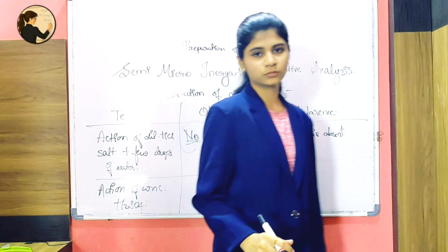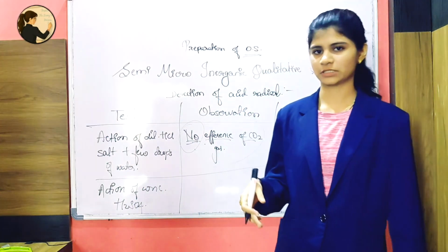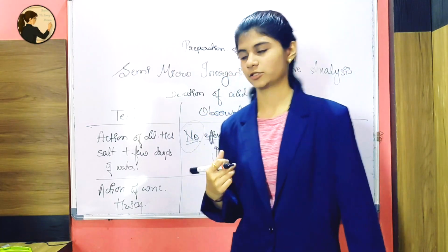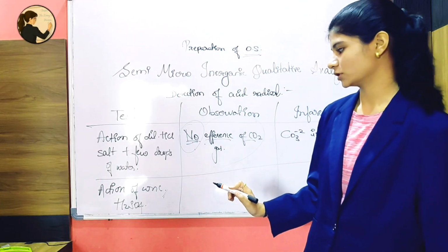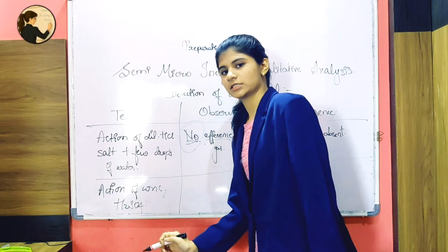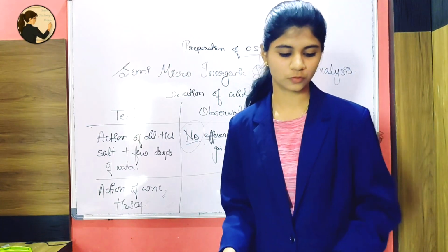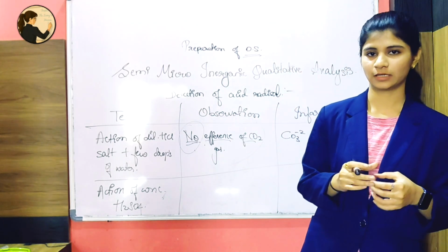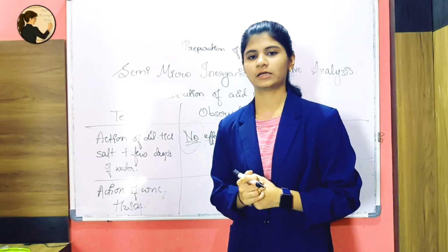Now what will you do? You will wash that test tube. Whatever it was there, you will just clean it, wash it, and then you will take another dry test tube. In that you should watch whether action of concentrated acid is happening or not. It means if you throw away whatever was in the test tube, then it will definitely waste your time.